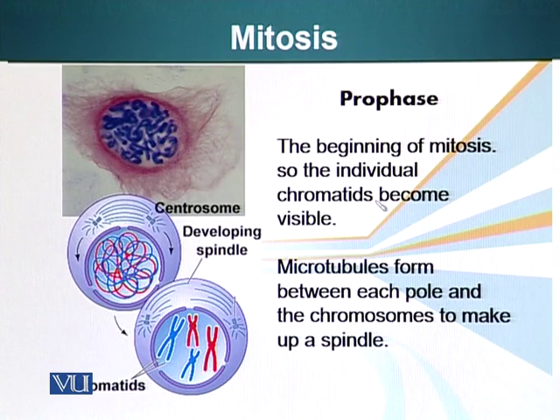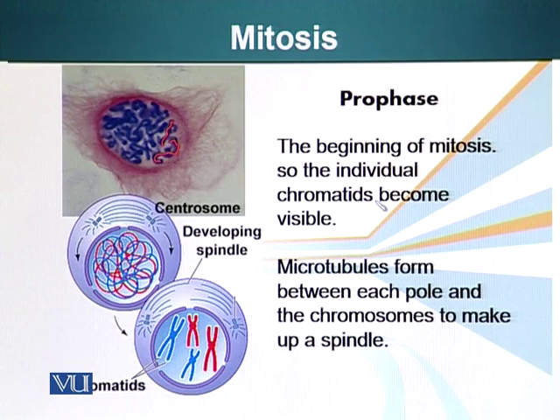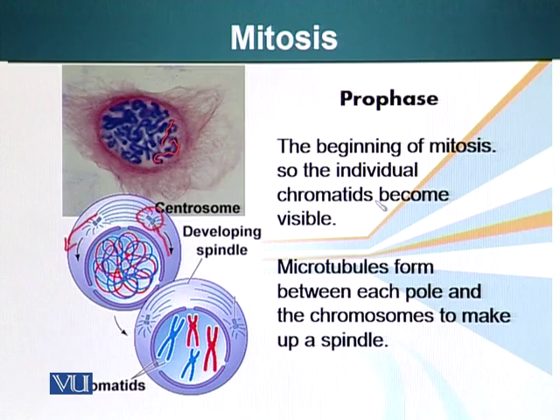Here you can see a cell in pro-metaphase — the chromosomes have started to condense. You can see these linear, squiggly structures which are the chromosomes. The centrosome starts to divide and the two centrosomes move toward opposite ends of the cell, with microtubules emanating from them. These microtubules form the spindle, which holds the whole mitotic apparatus together.